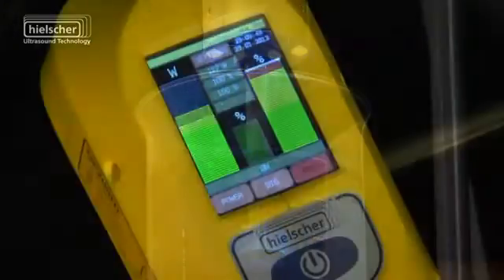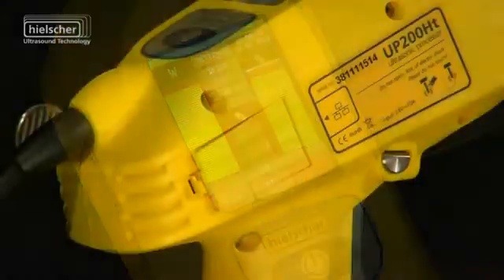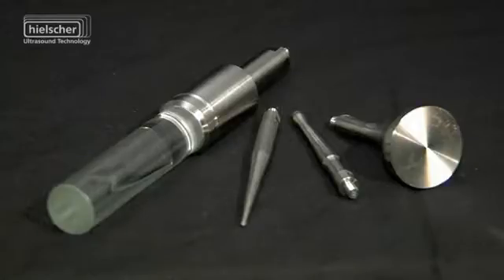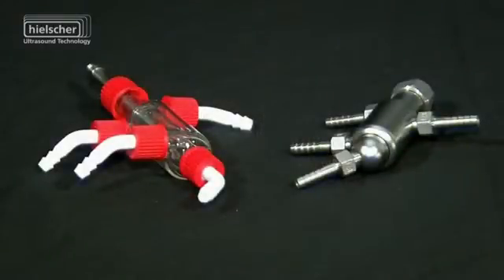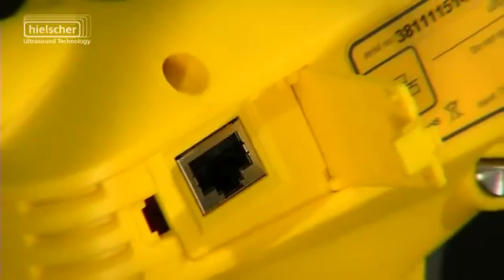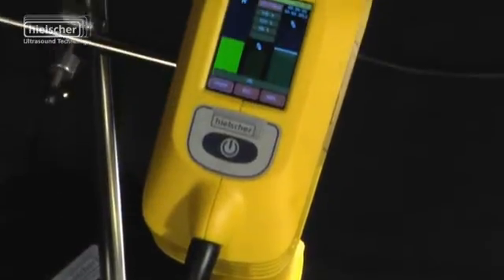the UP200HT is significantly more powerful than a comparable ultrasonic bath or cleaning tank. Thanks to a wide range of accessories, the user-friendly color touchscreen and the LAN interface, the Hielscher ultrasonic homogenizer UP200HT sets completely new laboratory standards.